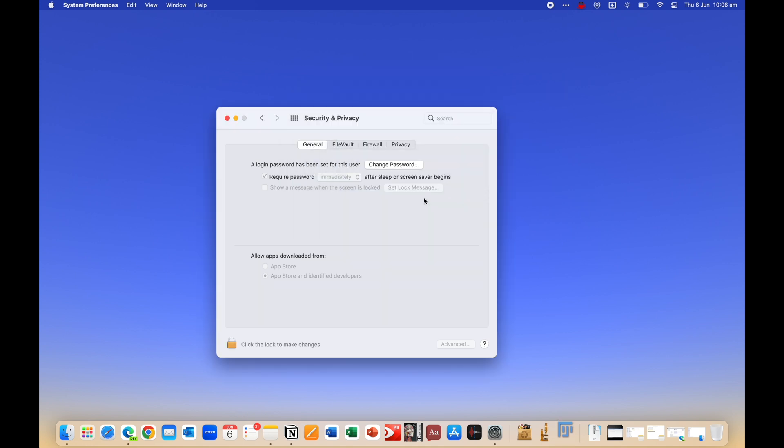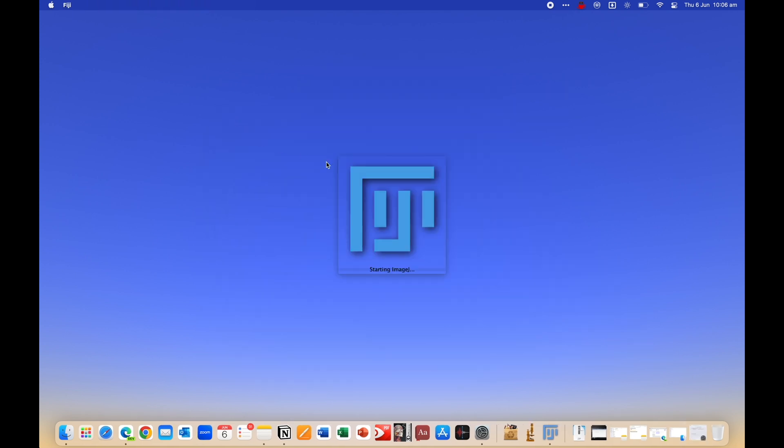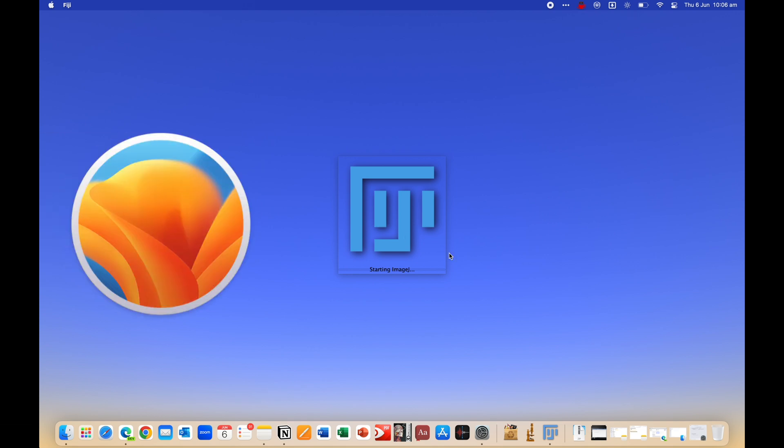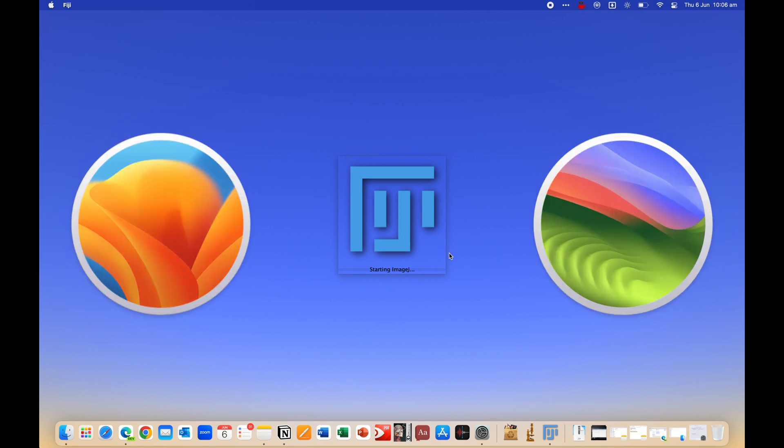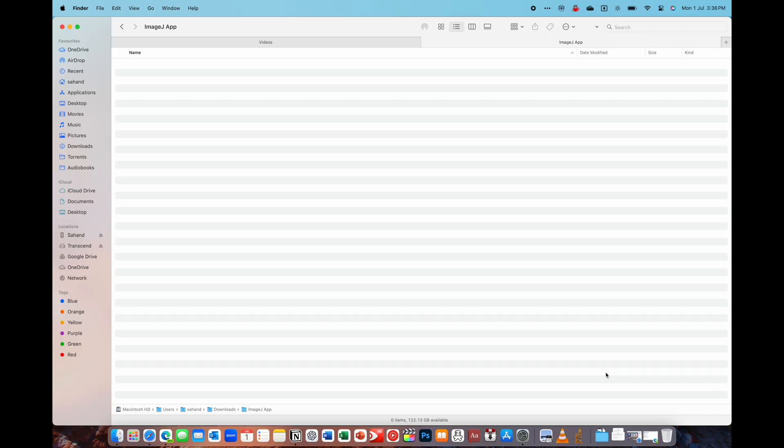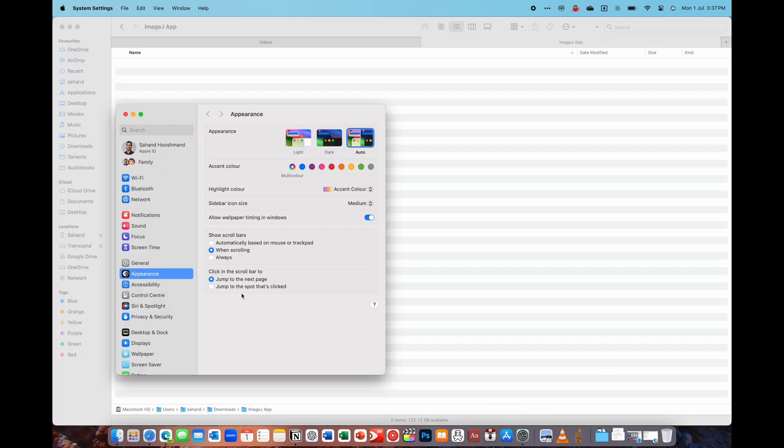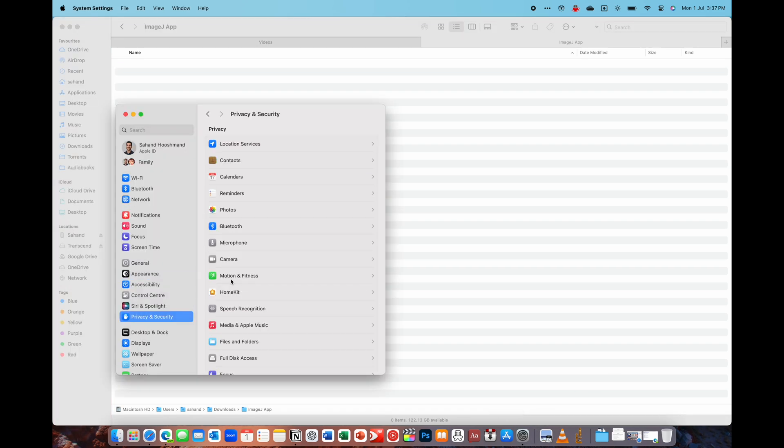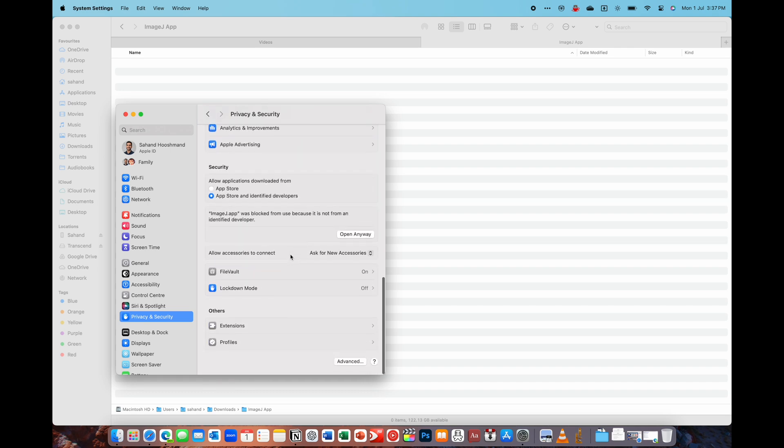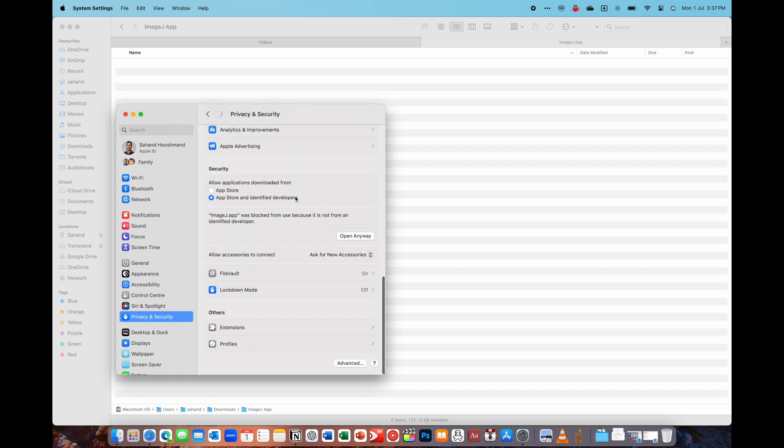And by the way, if you're on macOS 13 and above, so that'll be macOS Ventura or Sonoma at the time of the recording, then your settings app will look a bit different, but it's basically the same thing. So just on the bar on the left, find security and privacy. And if you scroll down, you should see the open anyway button.